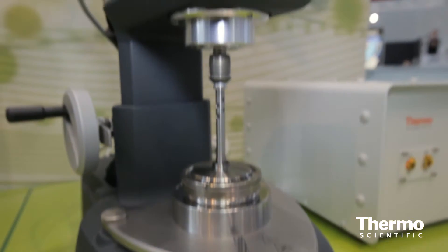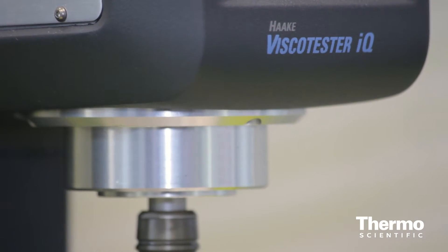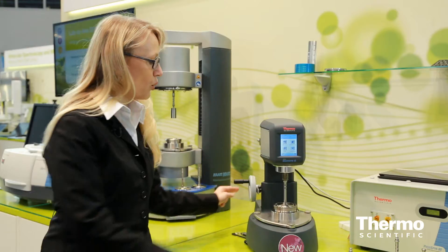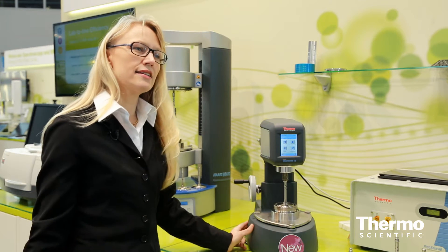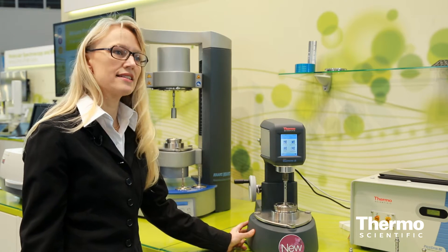This is a Thermo Scientific Haake Visco Tester IQ Rheometer for quality control. The instrument is equipped with a sophisticated design which enables a fast exchange between different configurations. We offer a wide range of accessories, measuring geometries, and also temperature control units. What you can see here is a system based on a Peltier which works from minus 5 up to 160 degrees centigrade.